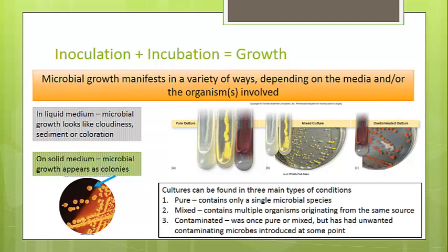So in a liquid media, which sounds just like what it is, a liquefied version of the media. It's a liquid. It's not solid, it's not gas, it's a liquid. And so in a liquid media, microbial growth is going to look like cloudiness, like sedimentation, there's chunks floating around, or it can turn the media colors. On a solid media, though, microbial growth appears as colonies, and you can see that on the slide. A colony is what the blue arrow is pointing to in the left-hand corner of the slide. That is what a colony is. It's microbial growth on a solid media. We don't see colonies in a liquid media, okay?